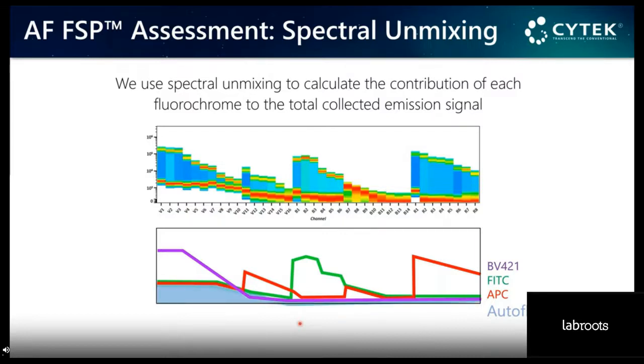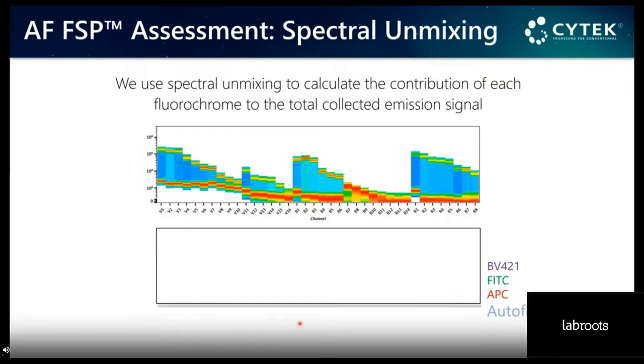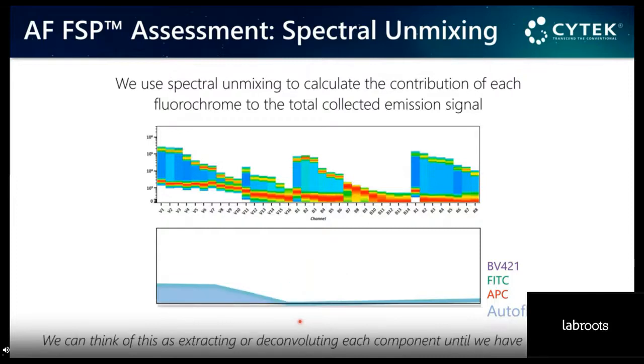First, it's going to subtract the autofluorescence, and then start deconvolving the signal, removing what's violet, what's red, and what's blue, until the equation equals 0. After this, you have two options. The first option, with just regular unmixing, is to add back that autofluorescence, or you could let the system extract it.